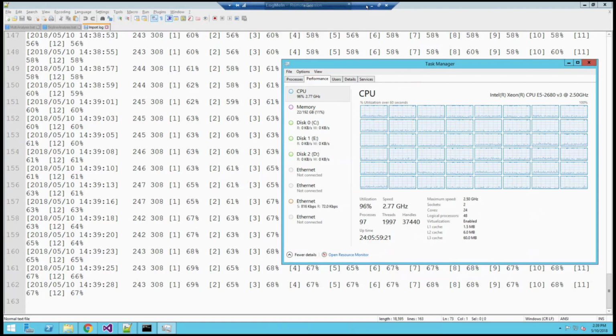The original implementation, because Skyline was built for SRM, used maybe 1 or 2 cores and really didn't stress it. But now, if you use the command line, we can totally use every ounce of your CPU. You can see that we're not using very much memory, right? We've got tons of memory, so we could do much larger jobs in this.